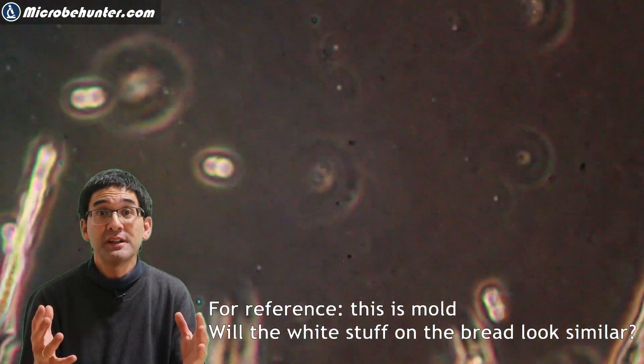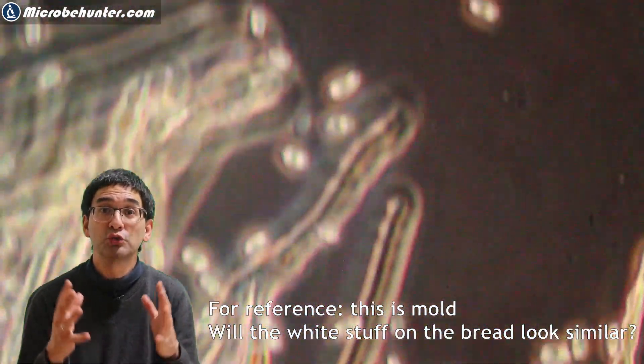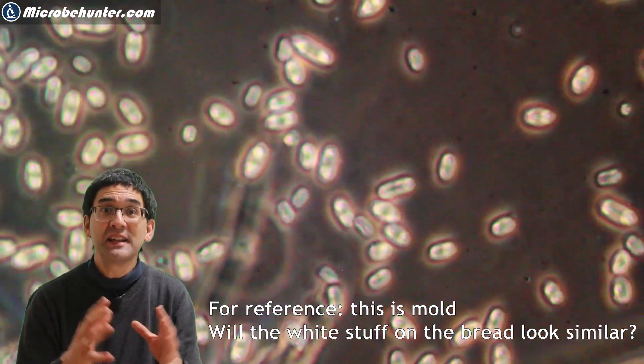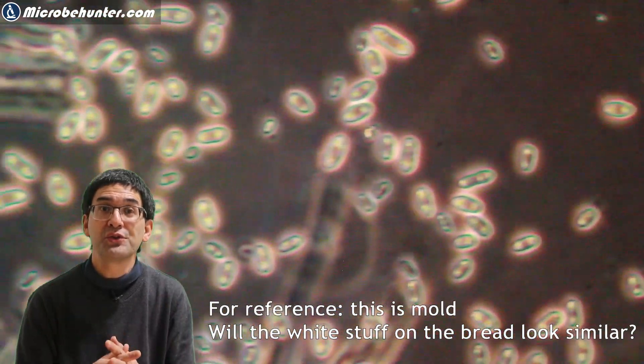Just as a reference, I also want to show you real mold that I found. Here we can see how fungal spores really look like. You will notice that they all look more or less identical, and other parts of the fungus like the hyphae you can also see.